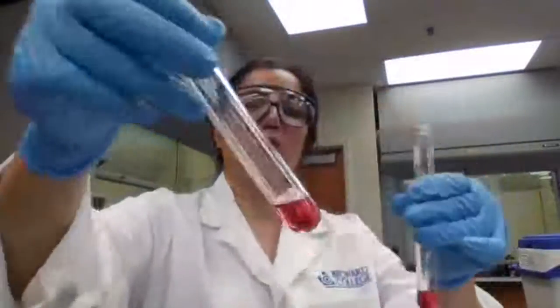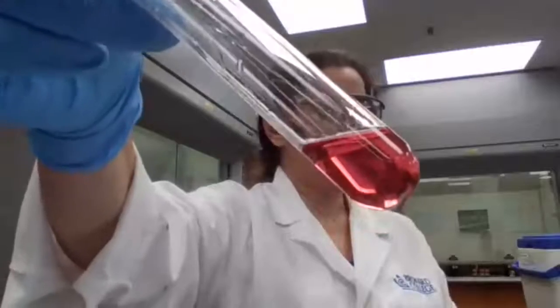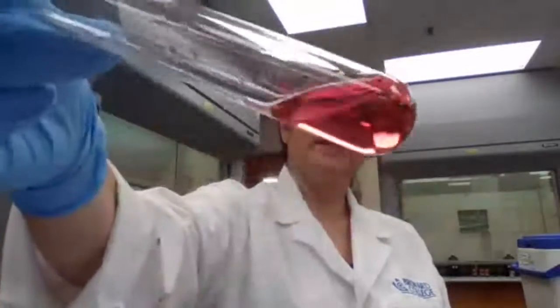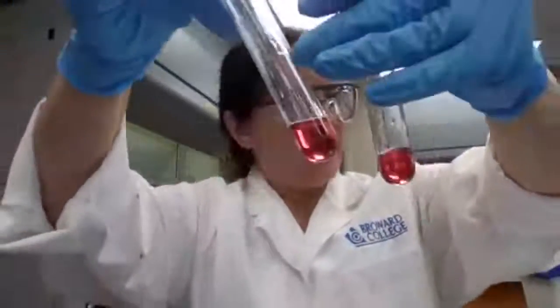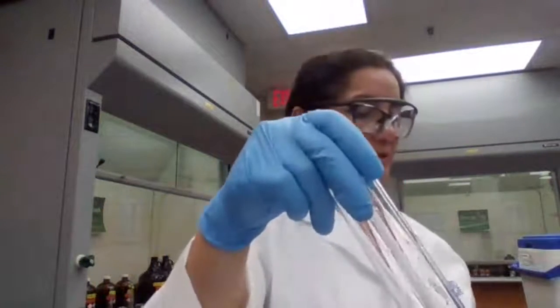I want you to record the color of cobalt 2 chloride. This is before adding anything, or before any changes.